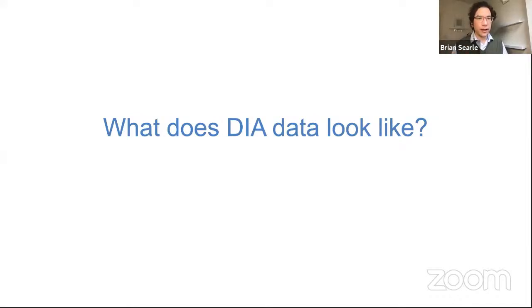And the last question, can I collect DIA data for discovery using the same data as for a targeted experiment? What we are trying to do is discovery style experiments with essentially targeted data. We're treating this as a merger between those two different approaches, a normal discovery acquisition, but specifically from a targeted framework. So the type of data that we're acquiring looks like targeted data rather than DDA data, but it's still trying to be a discovery platform like DDA.